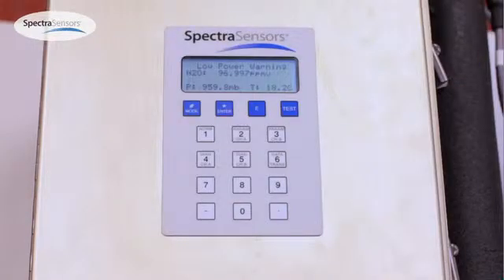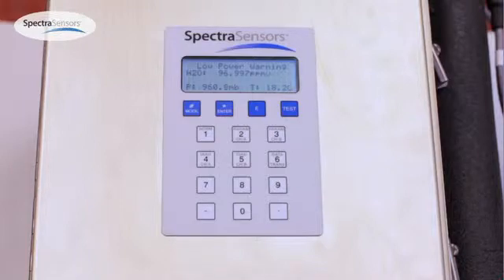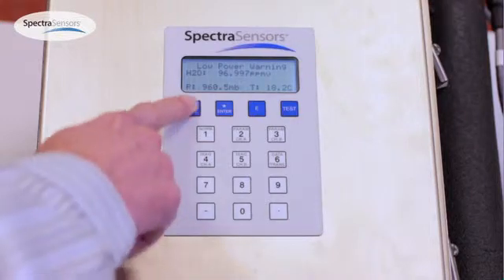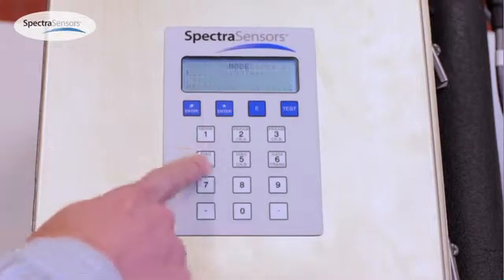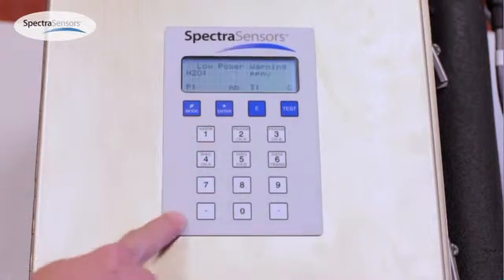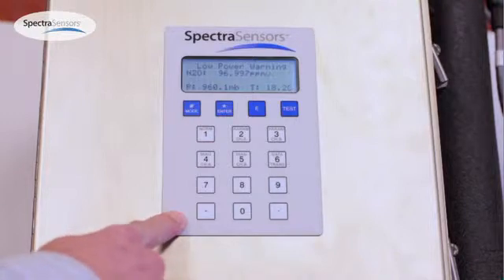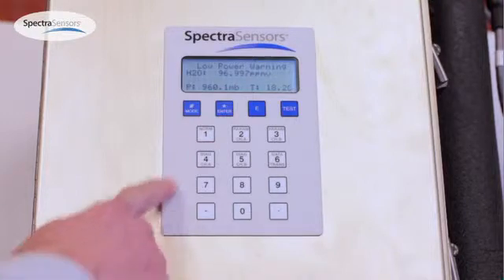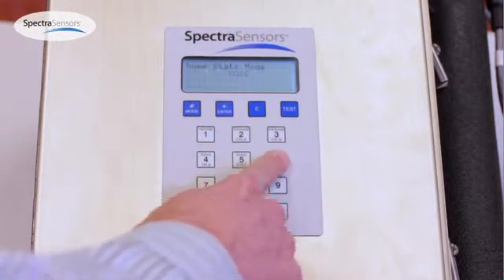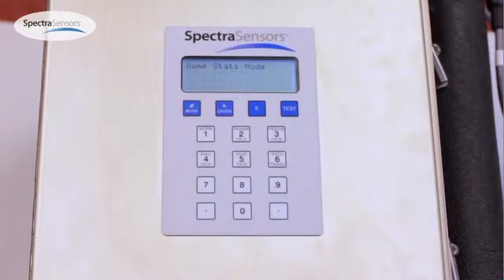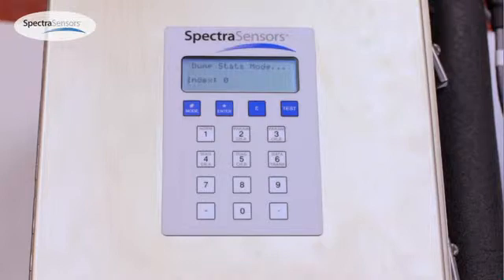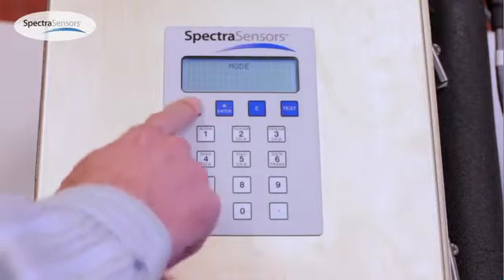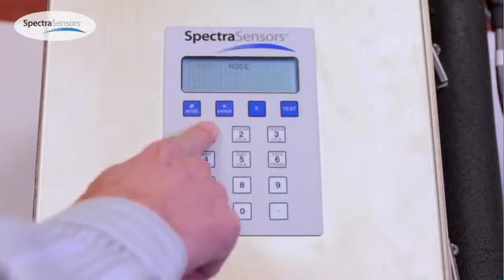So by default the analyzer is putting out normal mode data across the RS232. If you're in a submenu, you can return to normal mode to get this data stream by pressing pound one. To get a data download, press pound six and it starts the transfer. And once the transfer is complete, you need to return the analyzer to normal mode by pressing pound one.